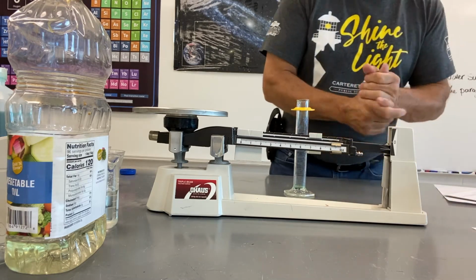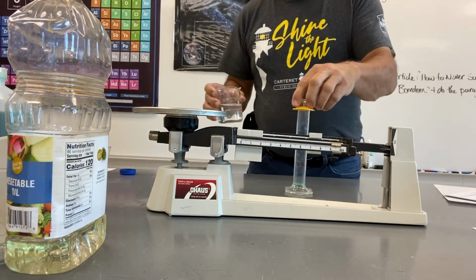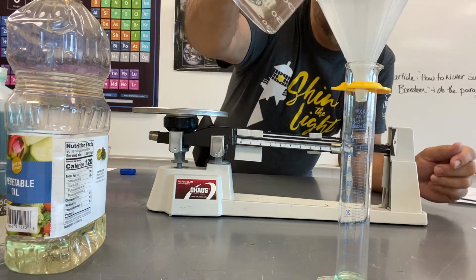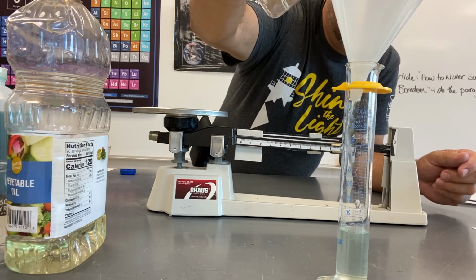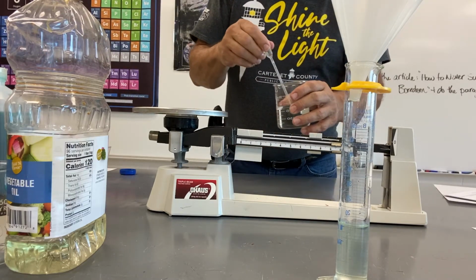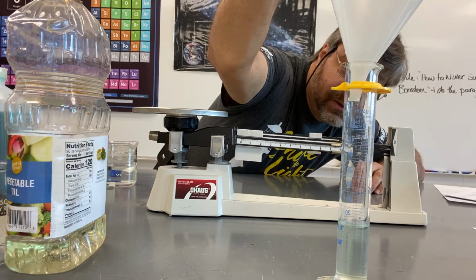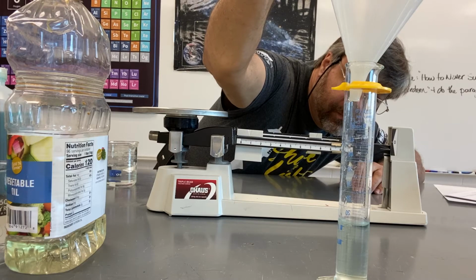And we're going to now find the density of water. And we are using 20 milliliters of water for this part of the lab. And this time we've got to be really, really dead on because we are weighing this. So it's not okay to just eyeball it like we did with the density column. All right, so I'm looking at the meniscus. And again, the lowest point of the meniscus is what I want on that line. There we go.